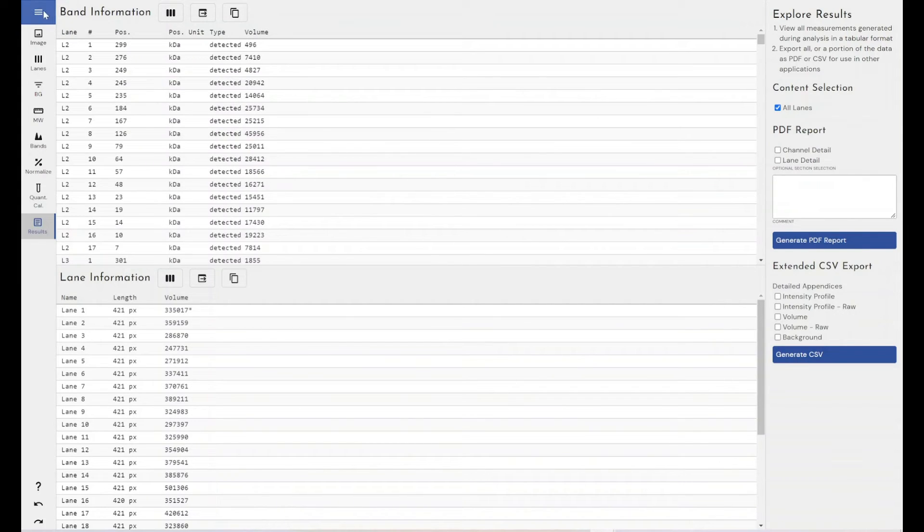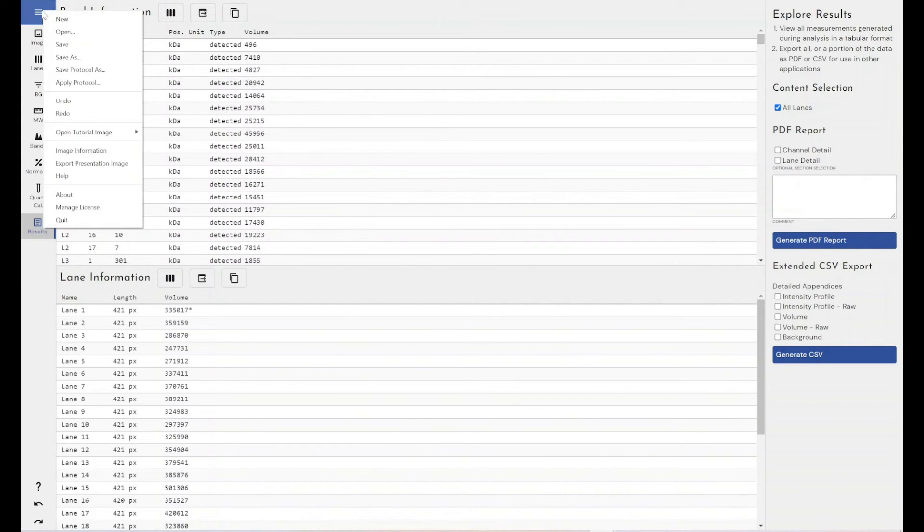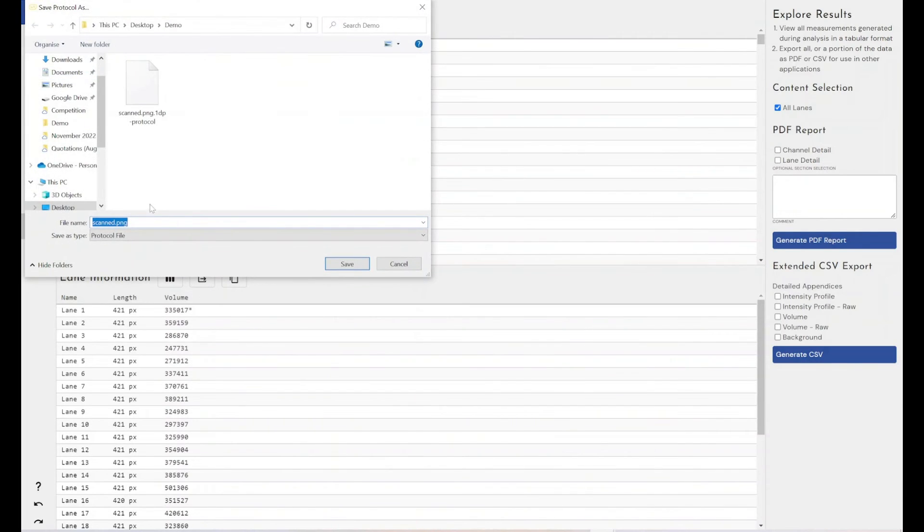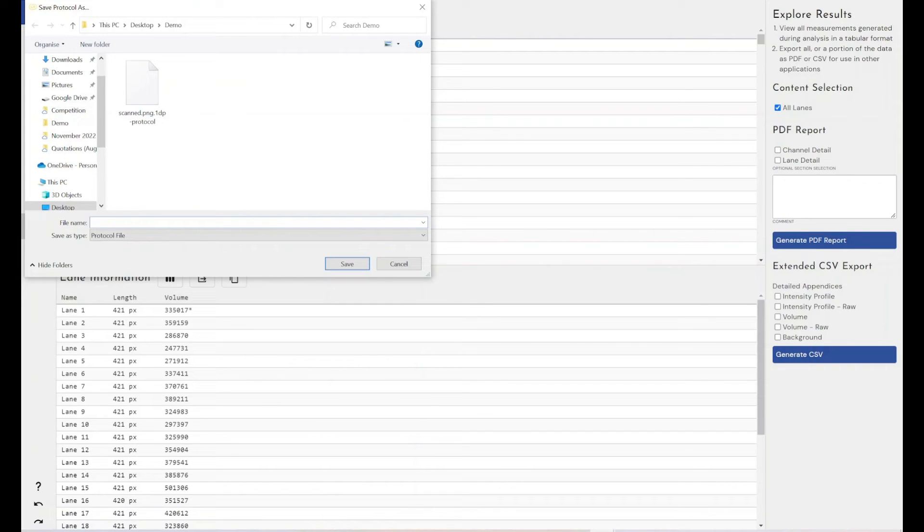What I can do is I can click on the main menu and save protocol as. And this will save every step that I've done there and the settings associated with it as a file in itself as a protocol file. So let's call this demo one protocol.